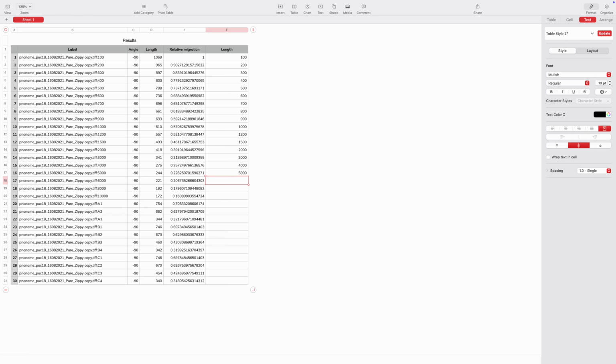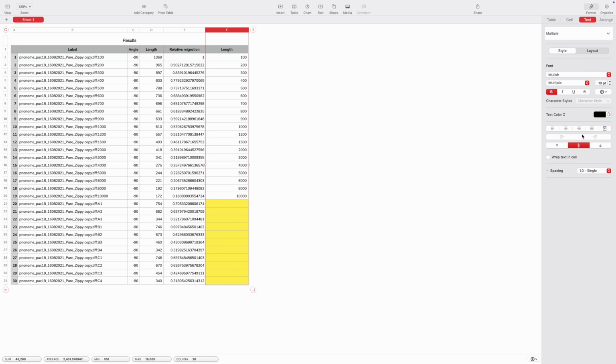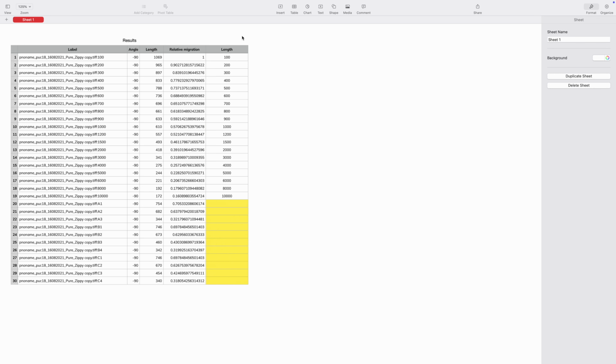Of course, if you have a smaller ladder, this would be way easier. I'm just showing you how you can do this, right? And of course, the length here I am going to leave unchecked, because this is the thing we would need to calculate basically. Just let me center this a moment.